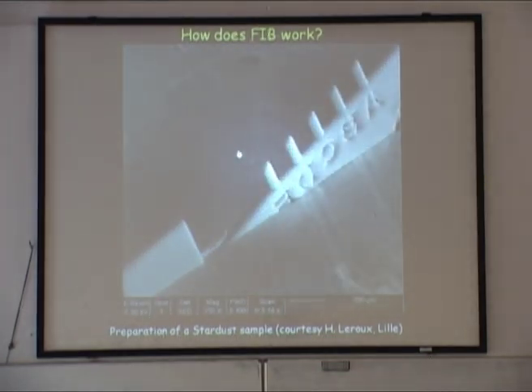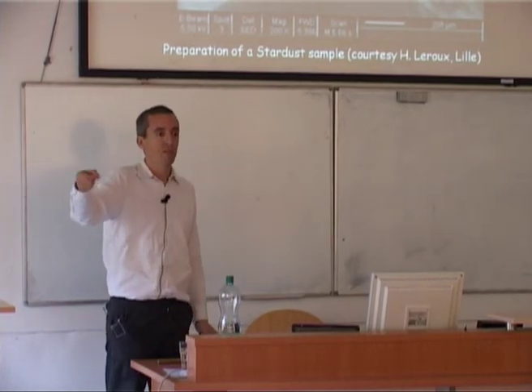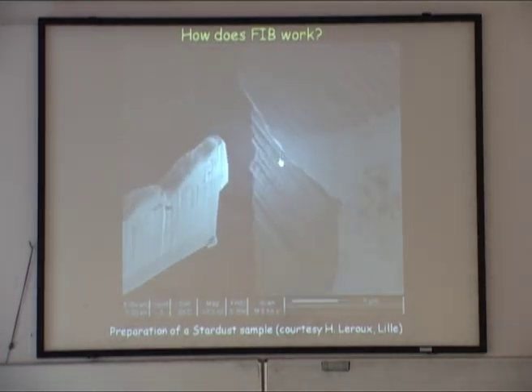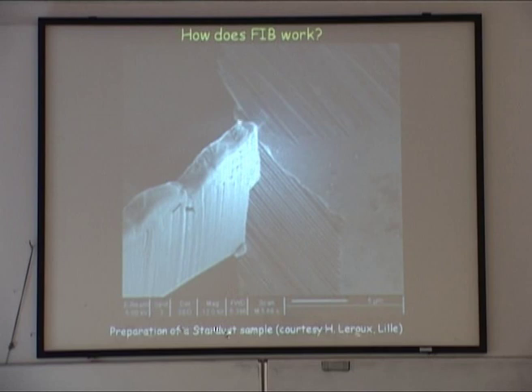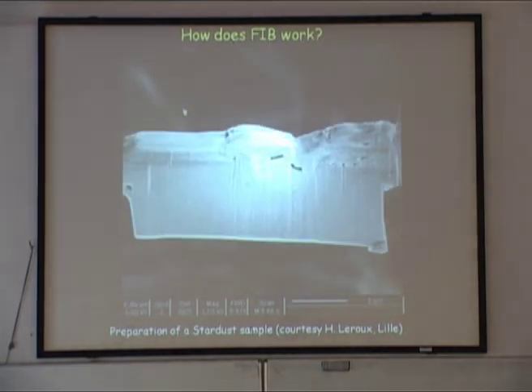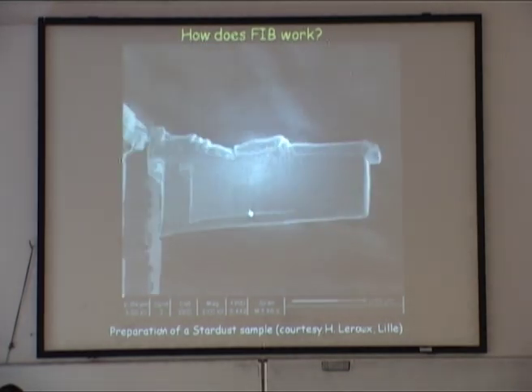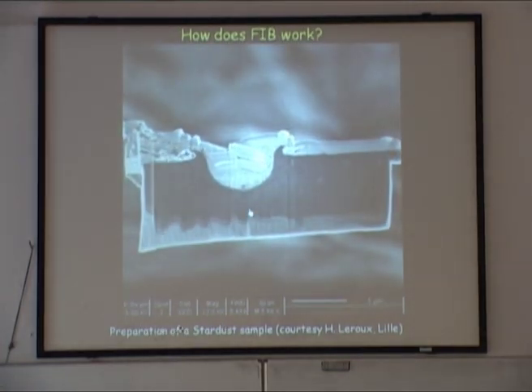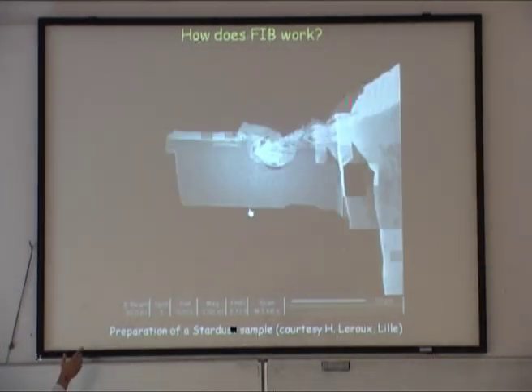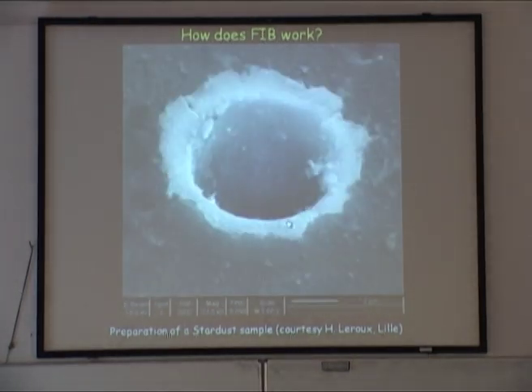Hop. They bring it to a sample holder. This is for TEM. This is a sample holder that you can hold with your tweezers. And so what they do is that they will glue the cross-section. So that's what you see. They deposit platinum here, and they glue it. And now they cut the needle from the section, and now they thin down the sample. Thin down to 100 nanometer. Okay, they do this. Once it's ready, you can get the sample holder out and put it in a TEM, and now you do TEM on the sample. And you see the cross-section. Okay, so now it's back.